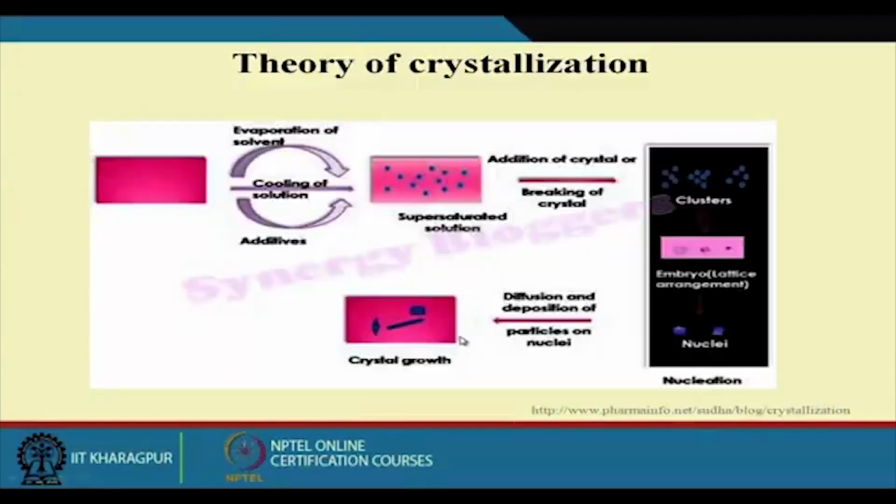Now, pictorially, that process can be explained like this. This is the solution. You can see when we evaporate the solvent, then we cool the solution. We form the supersaturated solution. We cool down, then particle formation takes place, with molecules adding to form clusters of crystals.